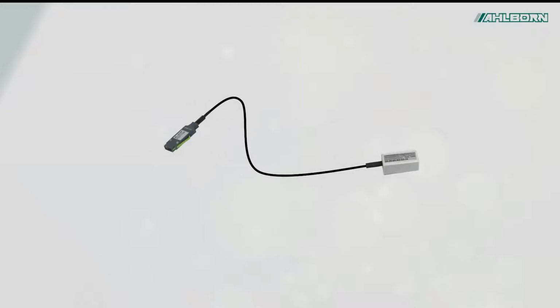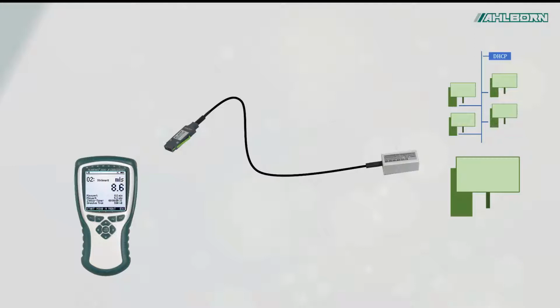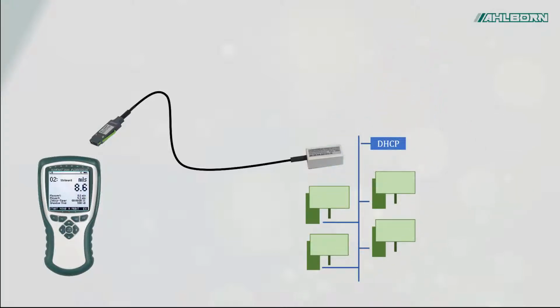With the ALMEMO Ethernet data cable, we can connect ALMEMO devices to Ethernet networks, to a PC or directly to the Internet. The two programs ALMEMO Control and AMR Win Control are compatible to this Ethernet connection.